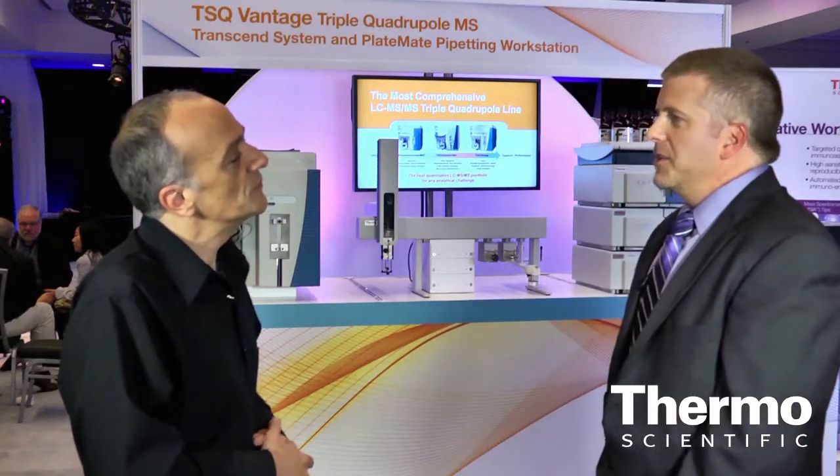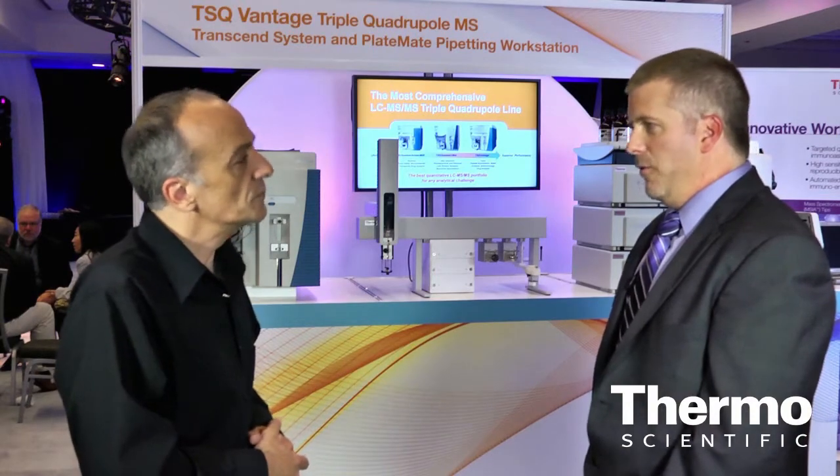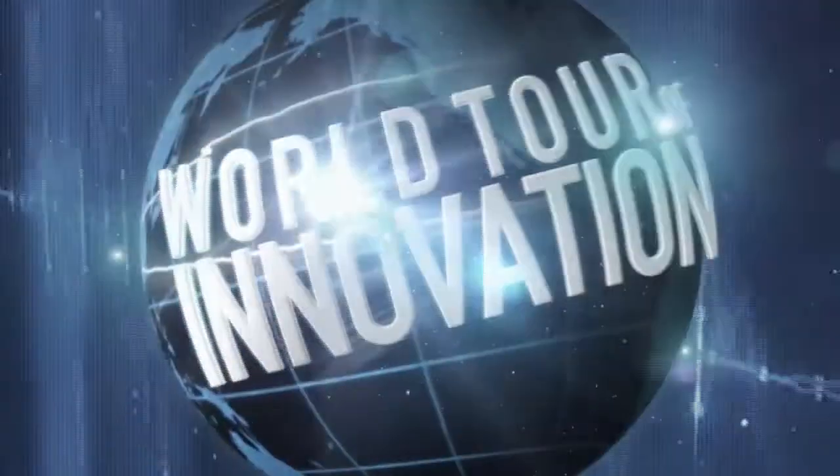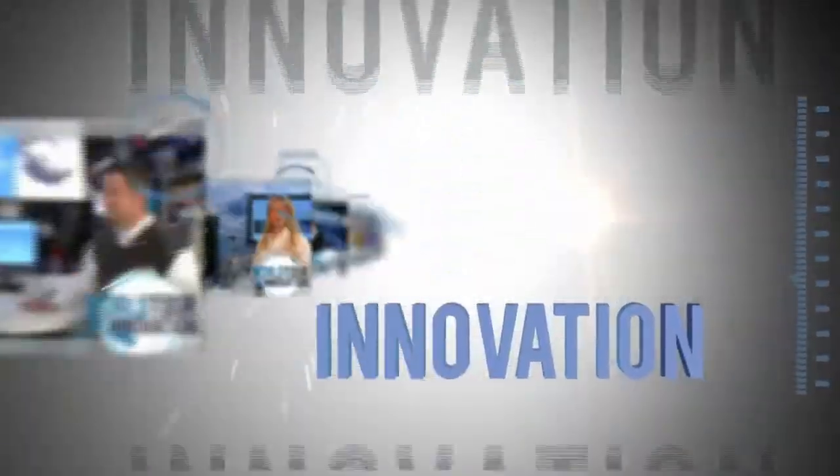What it all adds up to is Thermo Scientific offers the best triple quad on the market for quantitation. Learn more at thermoscientific.com/TSQ.